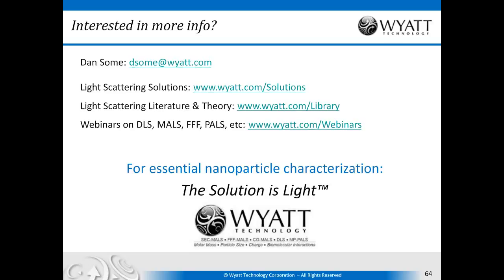Our first question is, what is the best way to discriminate between empty nanodiscs and nanodiscs loaded with protein? Exactly the conjugate analysis that I described earlier in the context of SEC-MALS. Nanodiscs typically can be used with SEC-MALS to get a nice separation. A nanodisc is typically composed of a protein ring encapsulating a lipid bilayer.